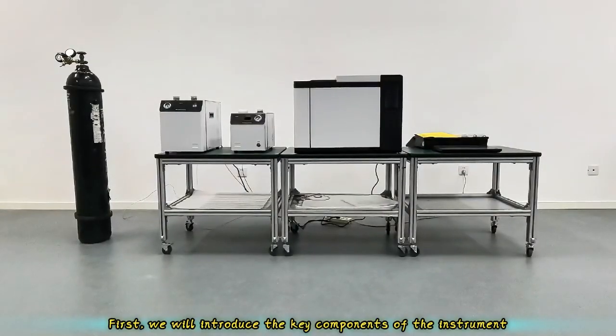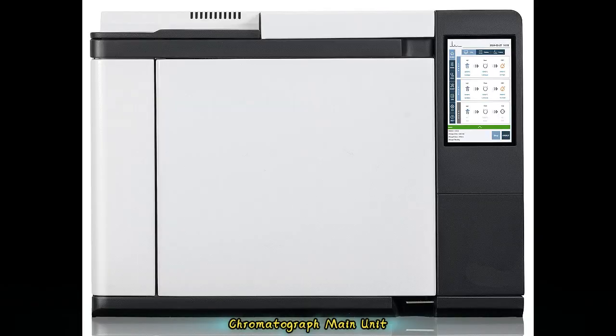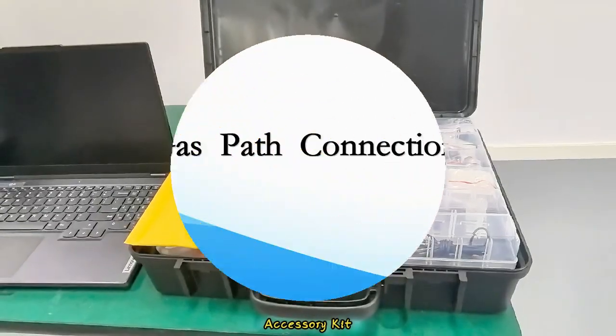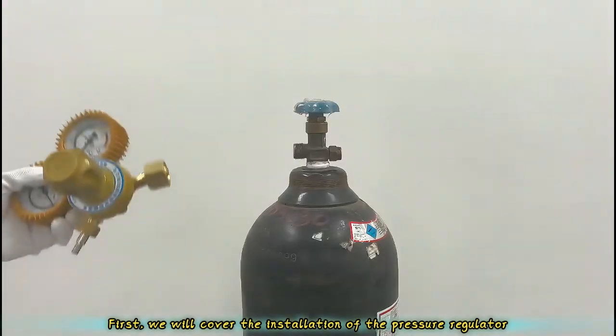First, we will introduce the key components of the instrument: high-purity nitrogen gas cylinder, air generator, hydrogen generator, chromatograph main unit, computer, accessory kit, gas path connection procedure. First, we will cover the installation of the pressure regulator.